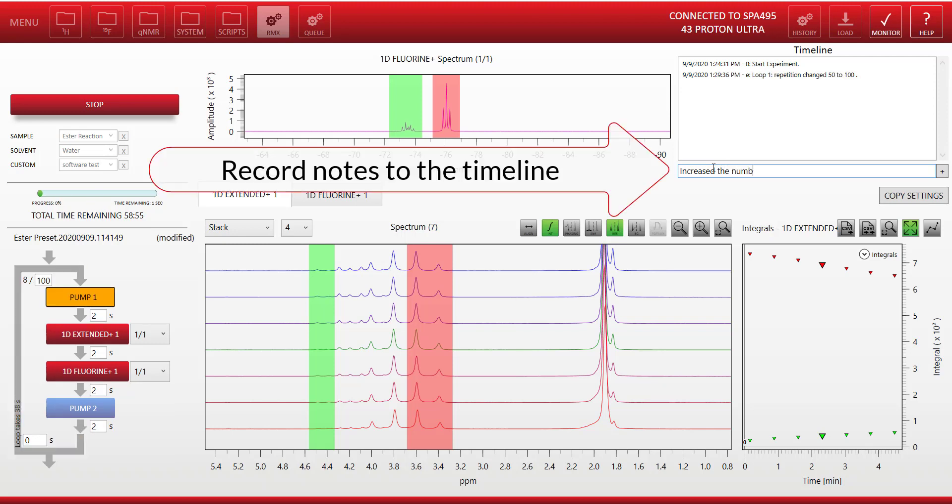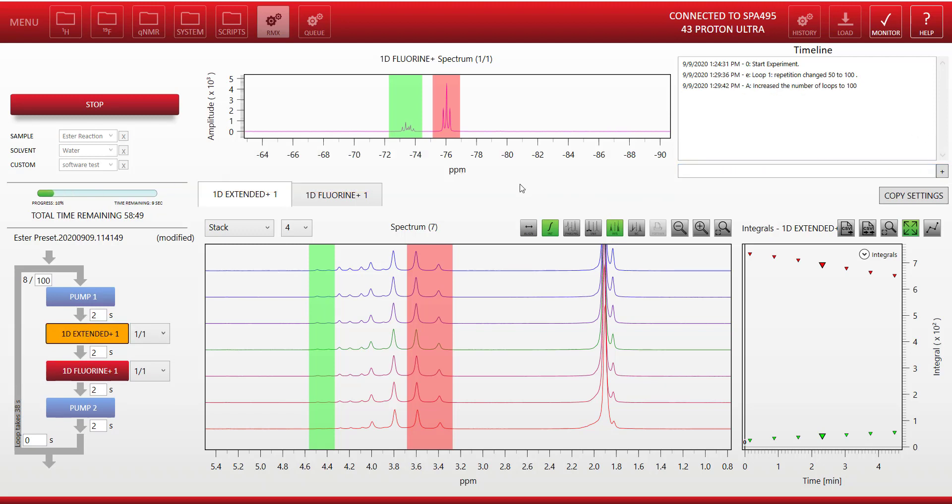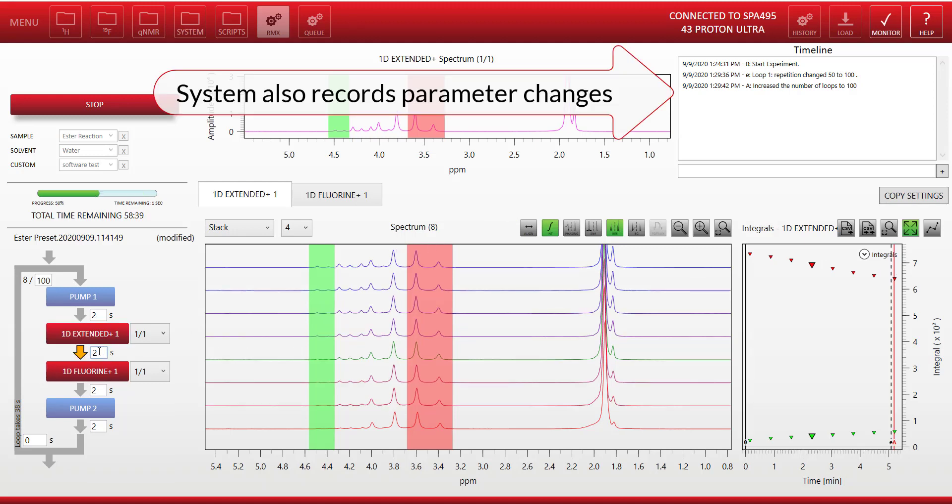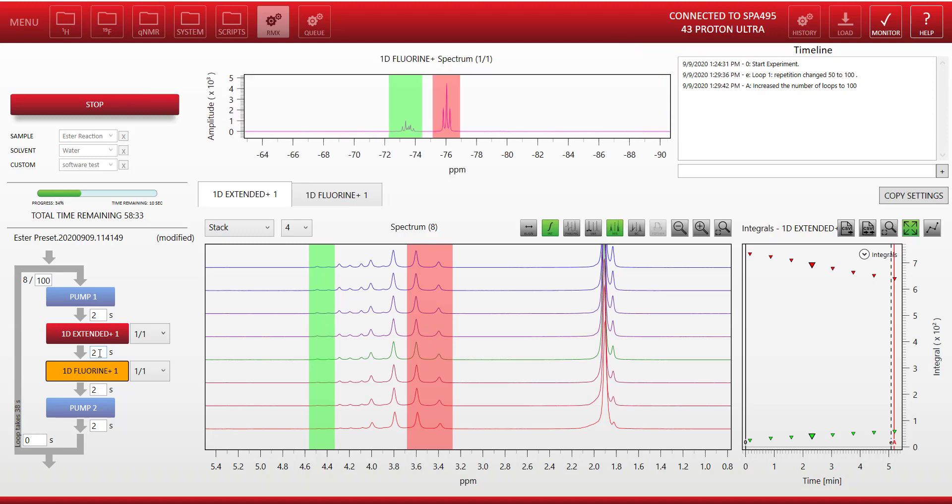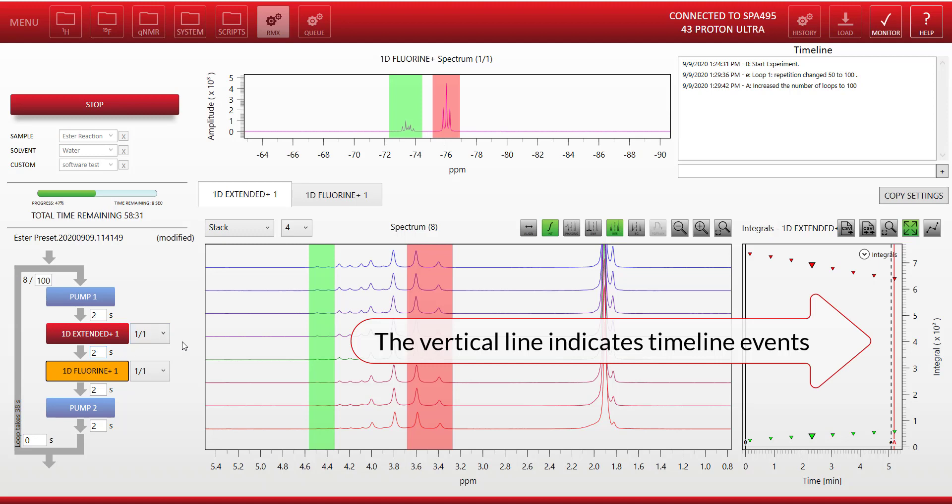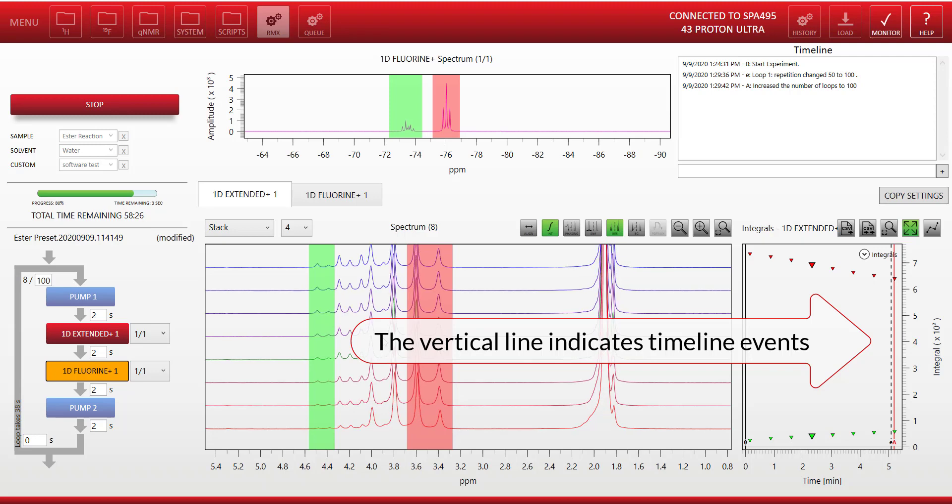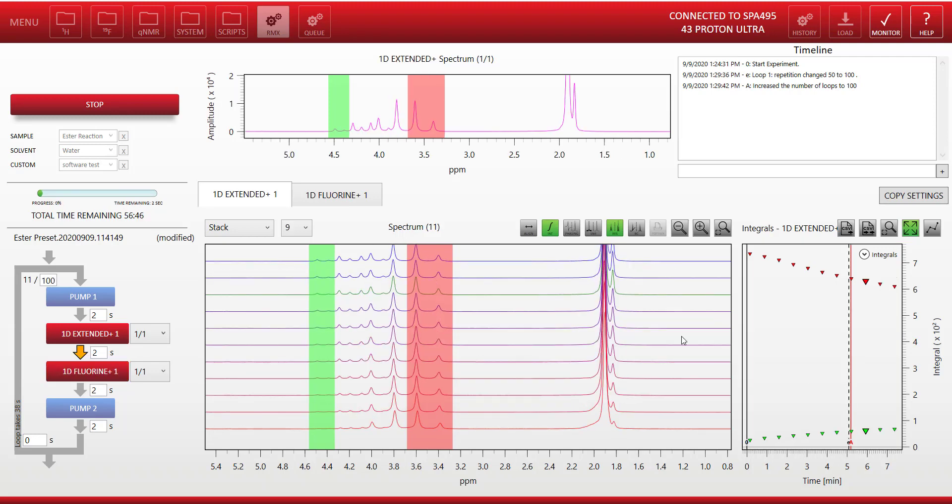In the top right there's a timeline window where we can record notes. So for instance here I can record that I've increased the number of loops to 100, or any changes to the reaction if I added another material to the reaction that could be recorded in the timeline as well. The system itself also records any parameter changes to the timeline, and you'll notice on the integral plot it puts a vertical line wherever there's a particular event in the timeline, so you can see where in the progress the changes were made.